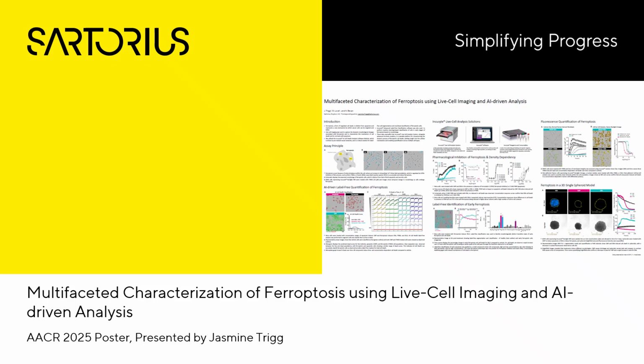Today I'll be discussing a poster that I previously presented at AACR, titled Multifaceted Characterization of Ferroptosis using Live-Cell Imaging and AI-Driven Analysis.